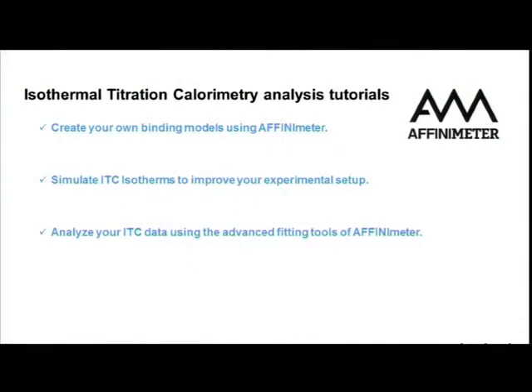So in this last part of the workshop, I'm going to talk about isothermal titration calorimetry analysis. This is a tutorial, and it refers to ITC analysis with the software AFFINimeter. In fact, it is not just one tutorial, but 3 tutorials where we pretend to describe the main functionalities of the software AFFINimeter.